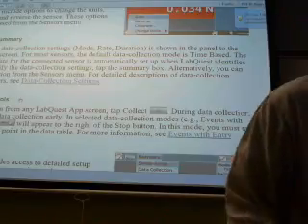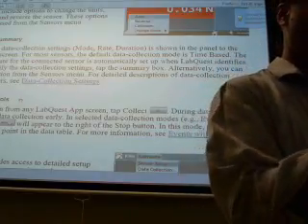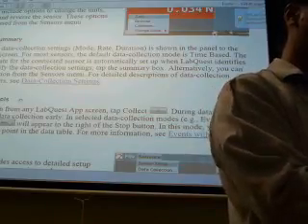All right. How is it that you save? Let's say the experiment's run. You can go to File, and then Save it, and then just name it something.